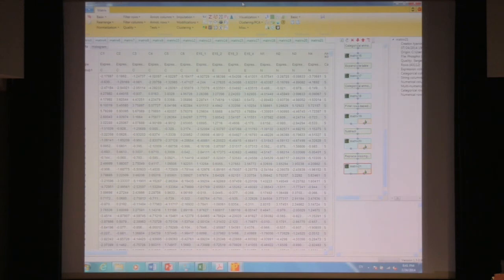What we were thinking is that if you think that your missing values are completely at random, then it might be better if you just take random values from the normal distribution without any adjustment factor. But if you're hitting your cells with a sledgehammer, LPS or something, then probably your missing values are because of the abundance, and then you may want to just pick from the low tail, basically. Okay, then if you wanted to do that, you can adjust the downshift. So if you don't want to downshift, just set that value higher.